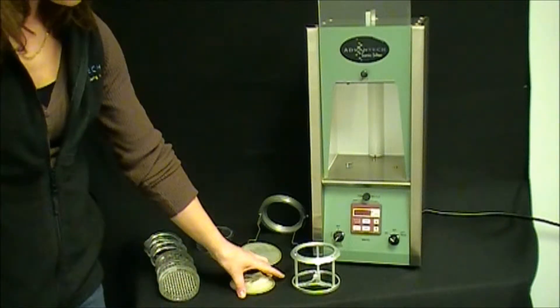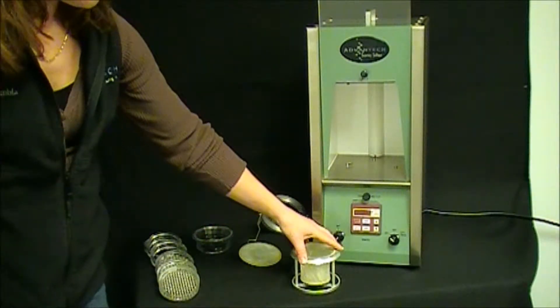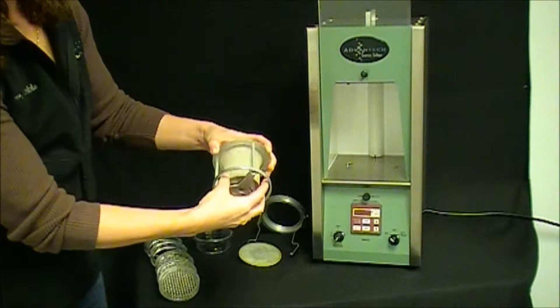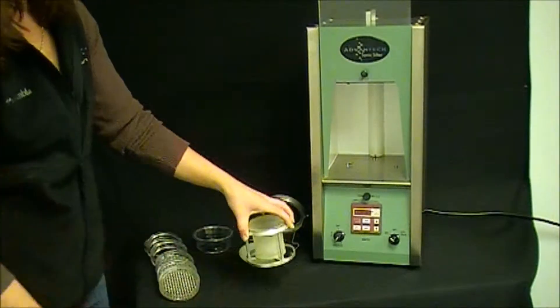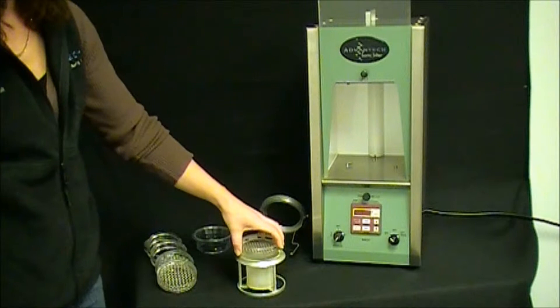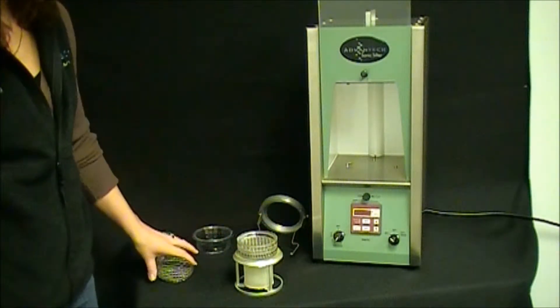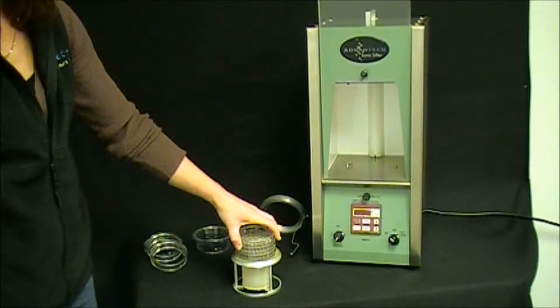You'll start by taking your fines collector and locking it into the fines collector holder and then build your test stack starting with your finest sieve at the bottom and arranging the test sieves incrementally coarser toward the top.